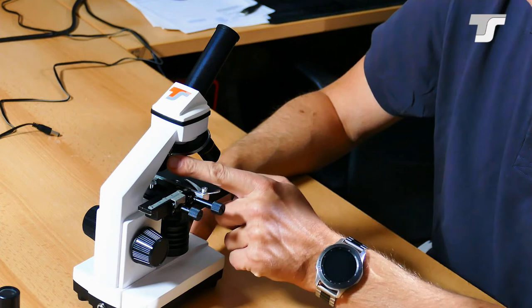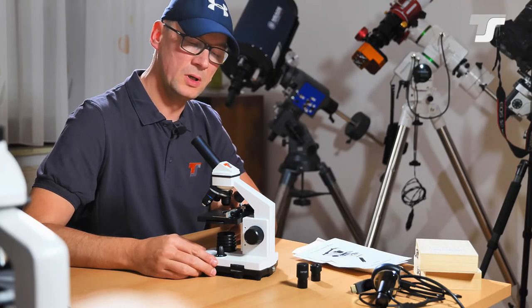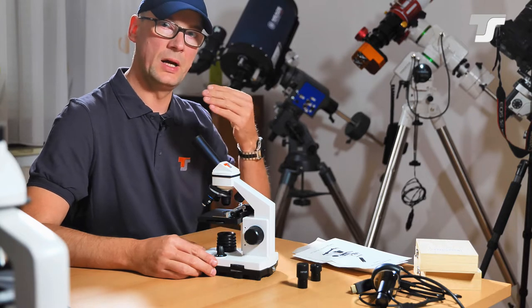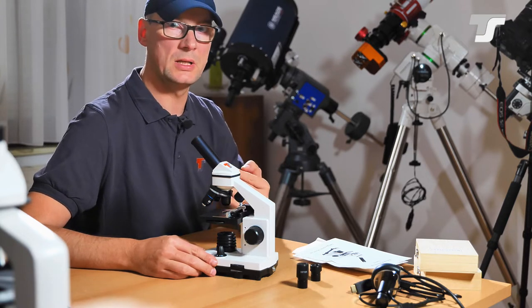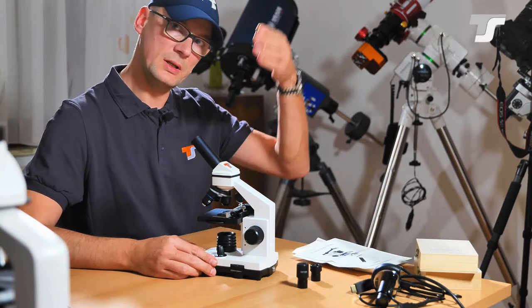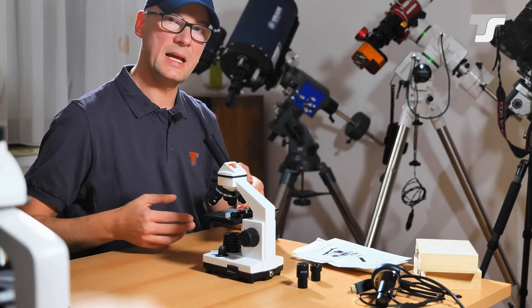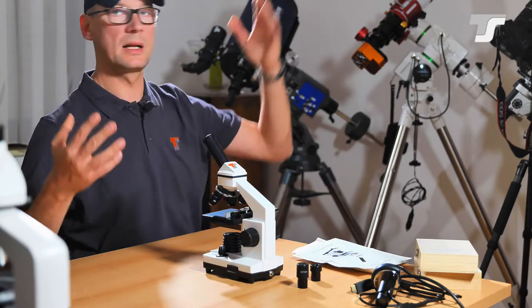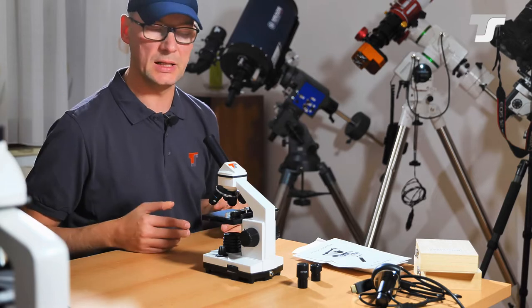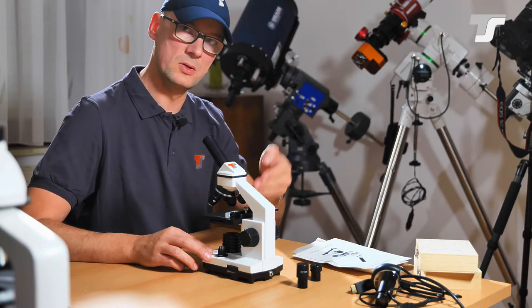Then here we have a light source. You use this light source for reflected light. If you have some opaque subjects that you want to observe then the transmitted light is not working. You need light from the top. And to get always the same lighting, different to sunlight for example, which is changing over time, you can use this light at 45 degree angle onto your subject.